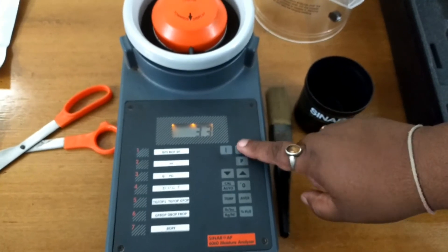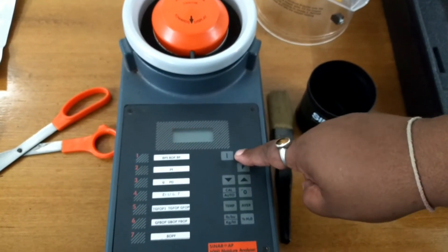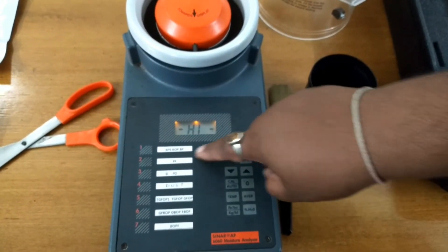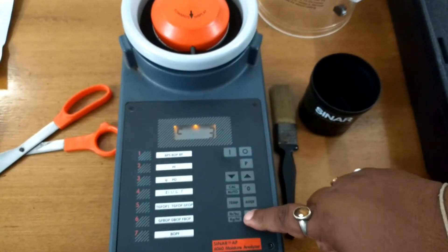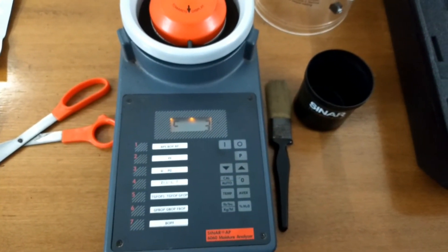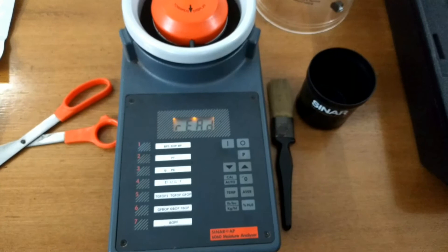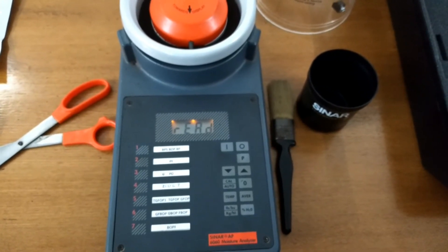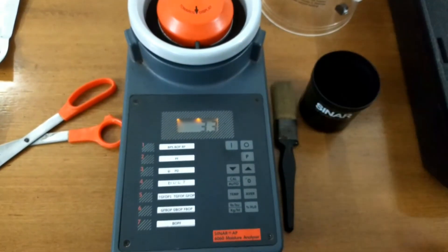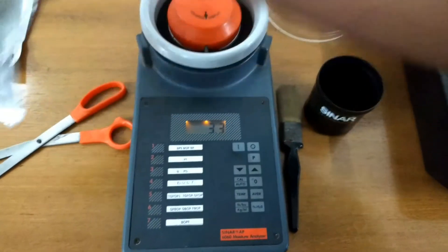Now, after this, switch off the machine, switch it on, then see channel number 3 once again. The machine is showing 3.3, which is within the sample specification.